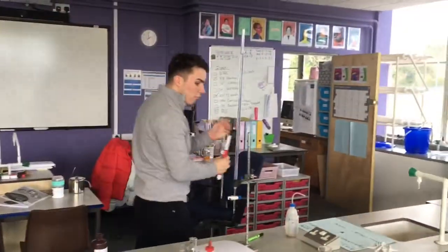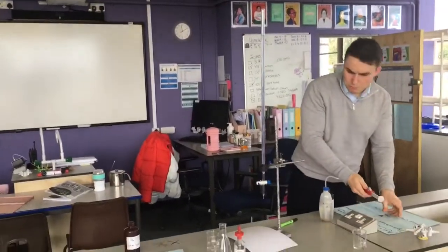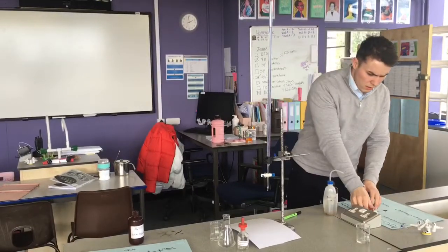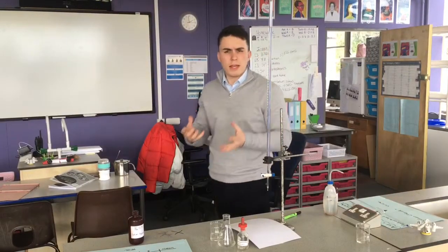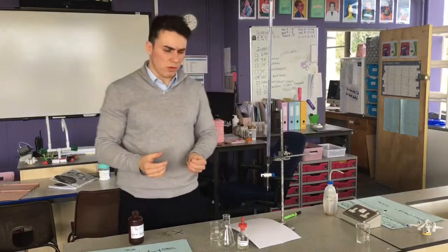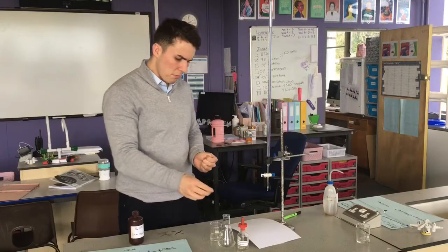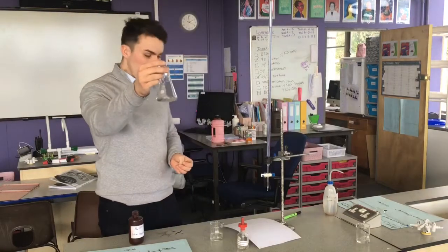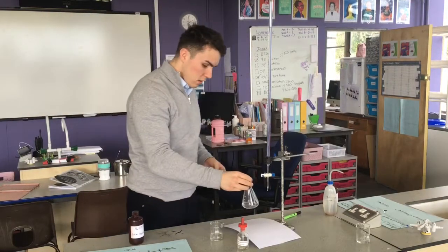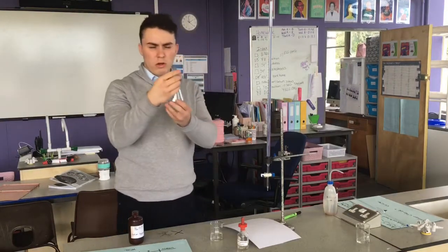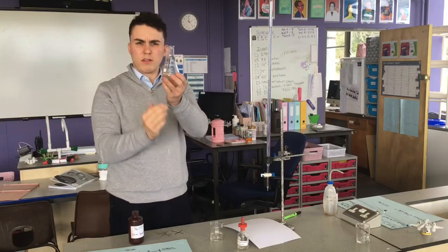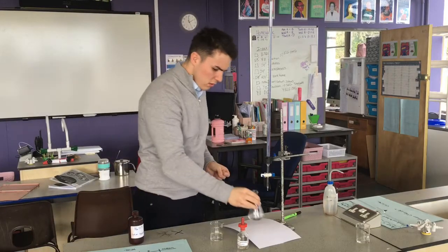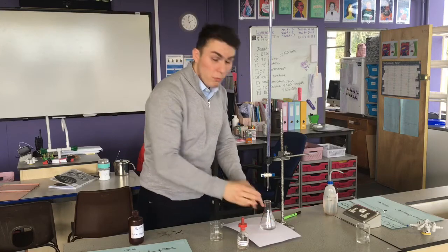If we weren't that worried about being accurate, perhaps we would use a measuring cylinder. But we're looking for real exact values here because we're going to perform some calculations. I'm going to place my conical flask on my white paper.